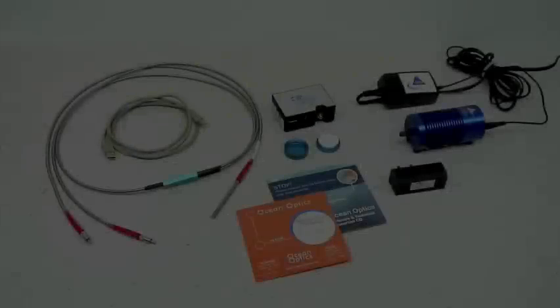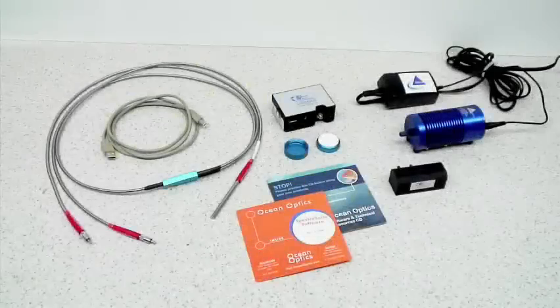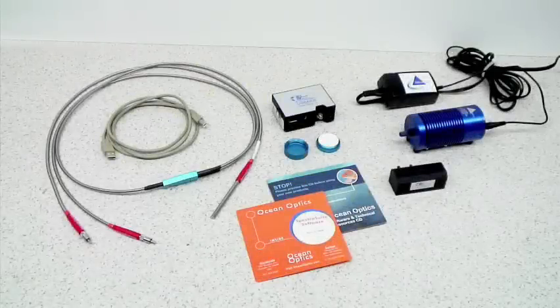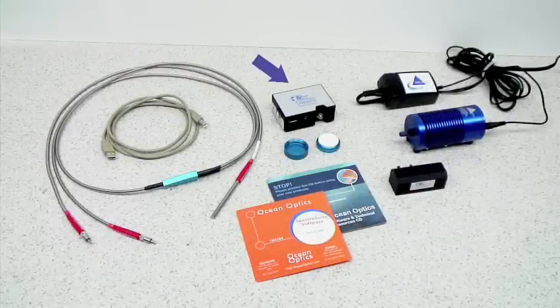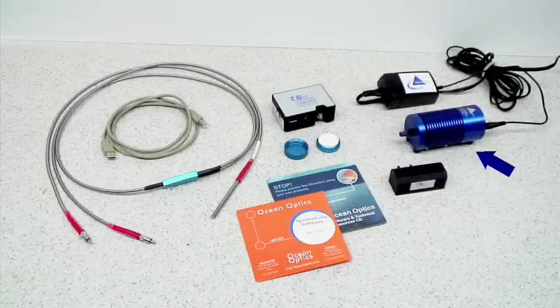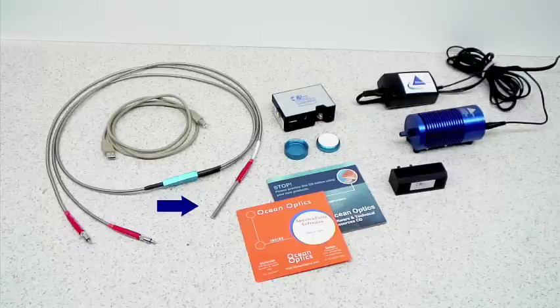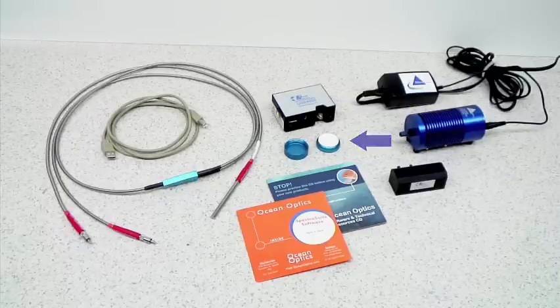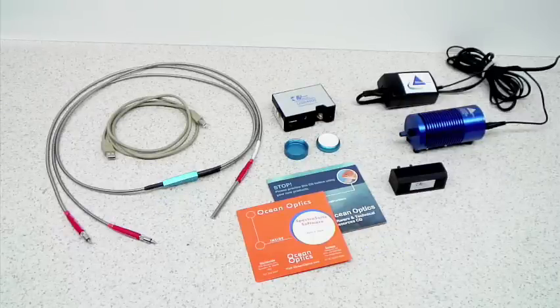For performing reflection measurements, you will need a spectrometer, light source, reflection probe, reflection standard, and SpectraSuite software.